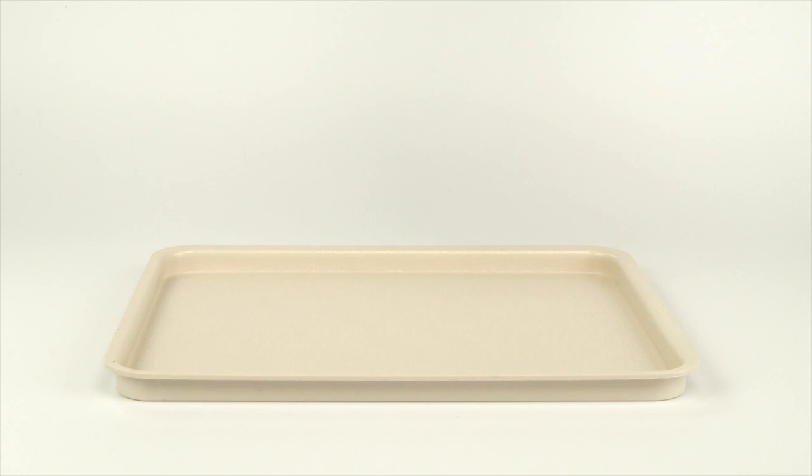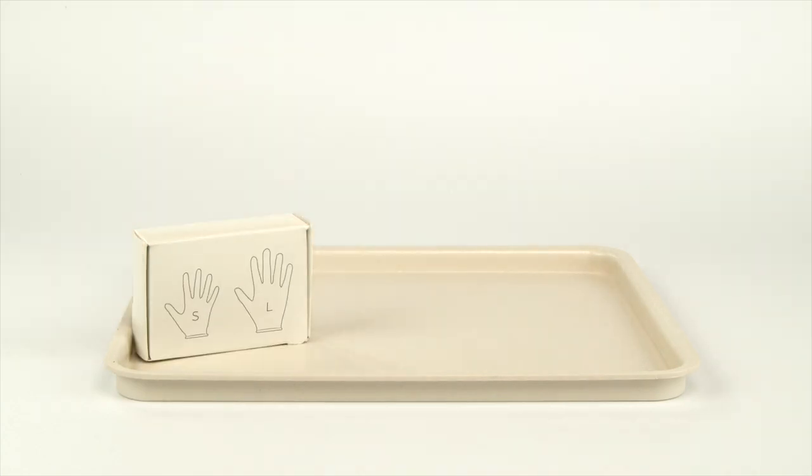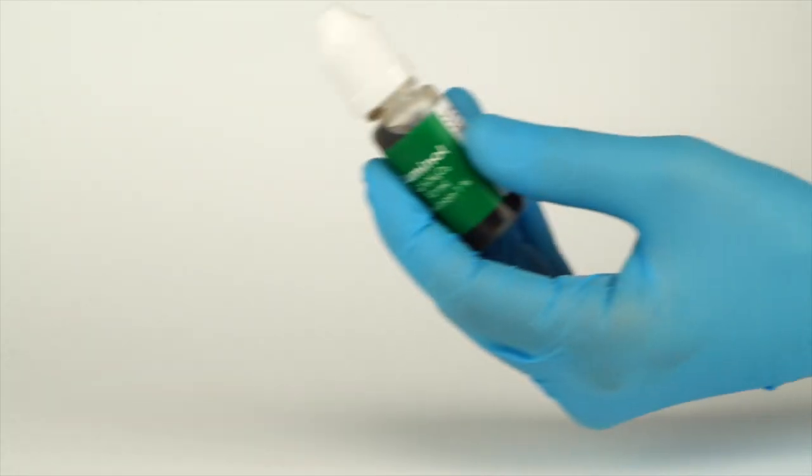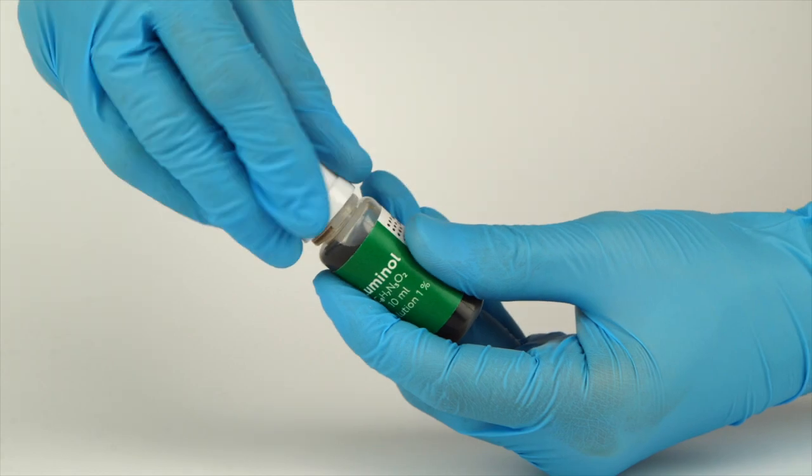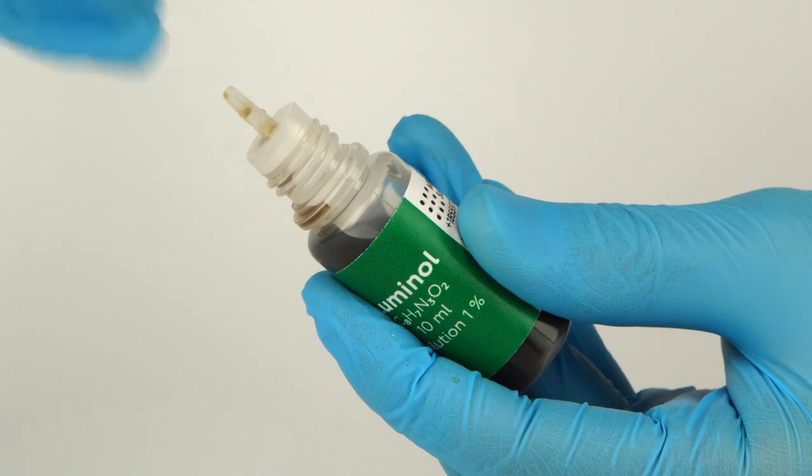Perform this experiment on a plastic tray to contain any possible spills. Don't forget to put on protective gloves and goggles before doing the experiment. To open a bottle containing a reagent, push the cap down and turn it. Carefully pierce the bottle nozzle using an unbent paperclip.